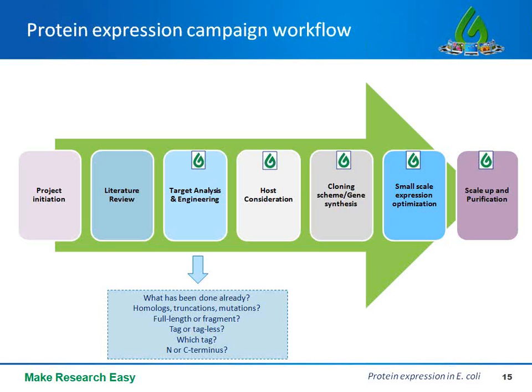So once you design the target, you begin the cloning scheme, right? Typically many researchers these days tend to adopt parallel strategies to facilitate high throughput cloning and expression. For example, strategies like ligation independent cloning or recombination based cloning allow you to generate multiple expression constructs at once, which is a good approach. Ligation independent cloning is friendlier in the sense it adds minimum vector residues, and it's perceived as more friendly for crystallography. Recombination based cloning is also a very efficient method.